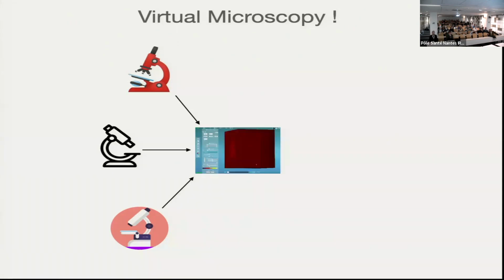This is an example of the video that now we can load. This is a light sheet microscopy image in 3D, and so here it's in 3D plus T. You can play, etc. But we need to improve that a lot because that was really developed for our type of data. That's the thing that we're working on.